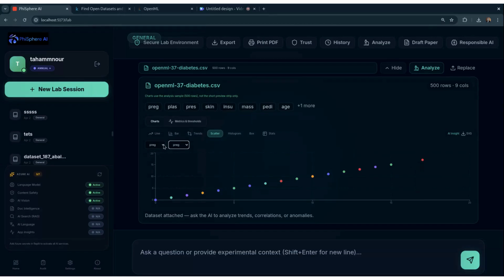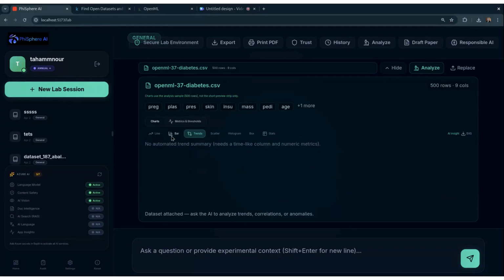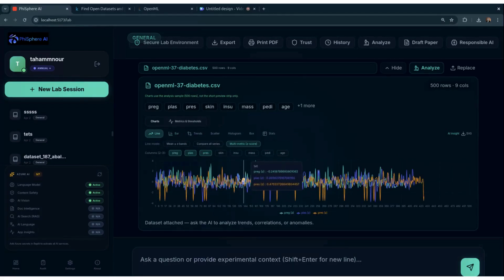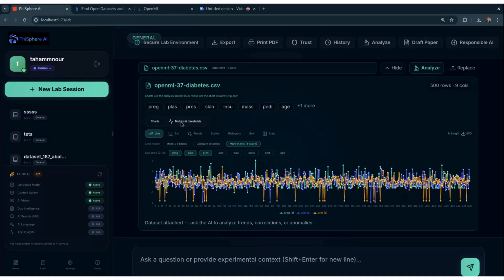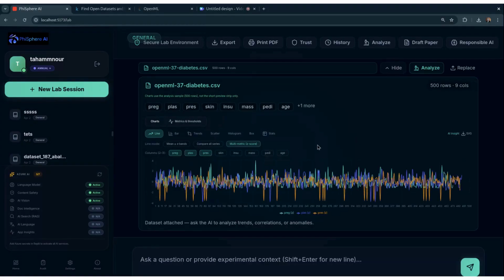Along with groundedness, PhiSphere also gives an explainable reasoning flow. When the assistant recommends a next step, it includes a "why I recommend this" style explanation. That explanation helps you understand what in the input data or context led to the recommendation. It also helps reviewers see that the assistant is following a coherent reasoning path instead of giving random suggestions.